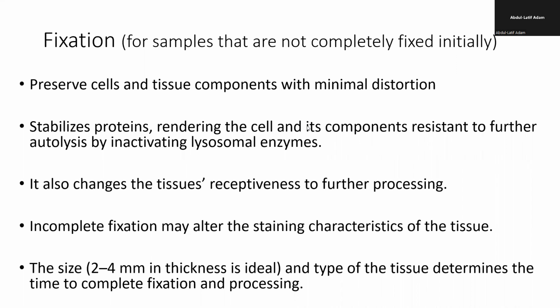What does the salt do? The salt removes water. So anytime there is water, water will distort anything that is tissue, that is meat or anything that is tissue, okay, that has cells. So far as water destroys them.